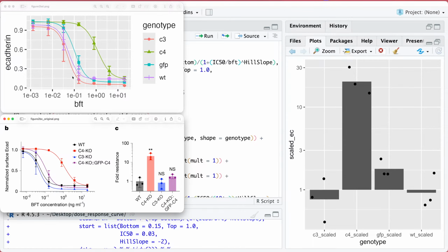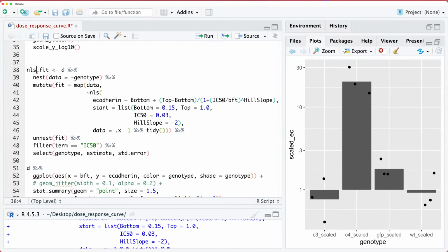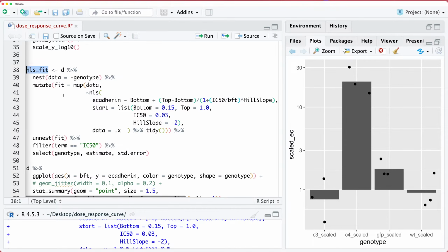Let's go ahead and clean up our plot a bit to look more like theirs before we bring in that data. But I think we have everything we need to go ahead and make the NLS fit look a bit better. Max asks, Max from Sweden, welcome.